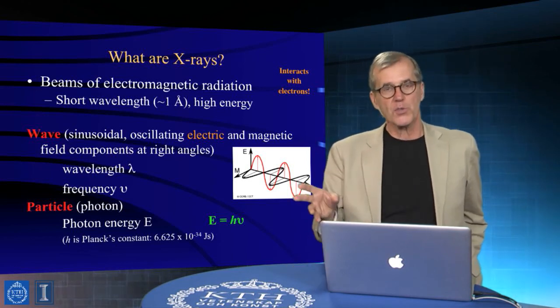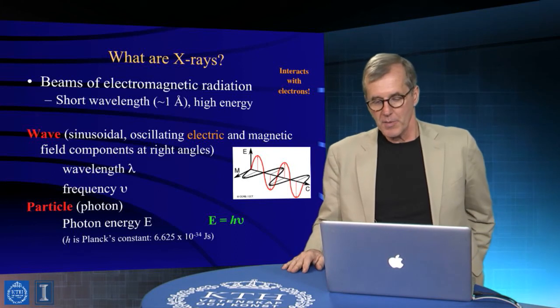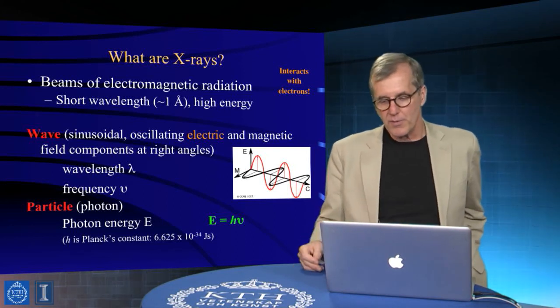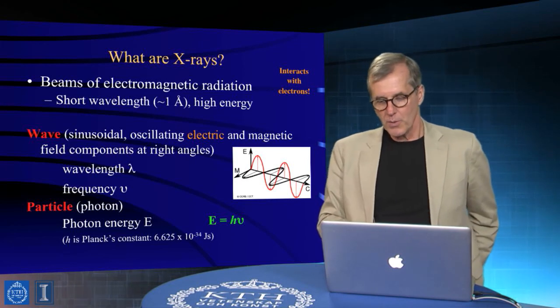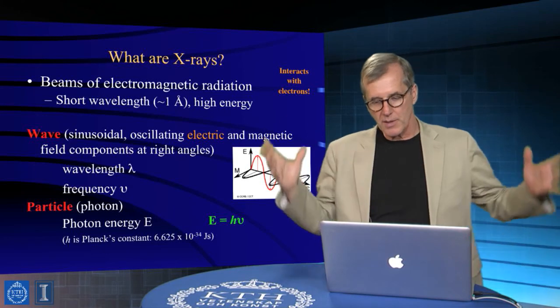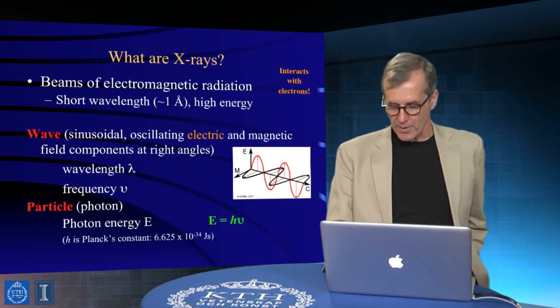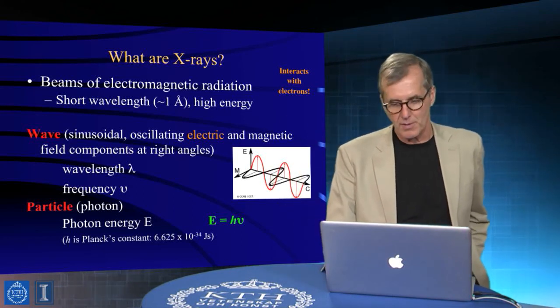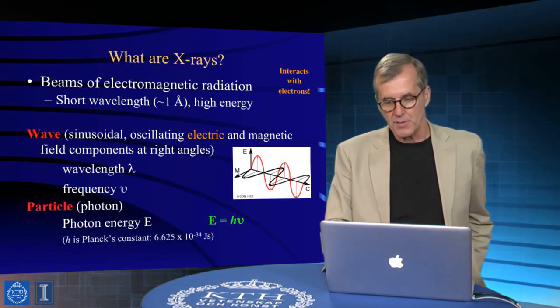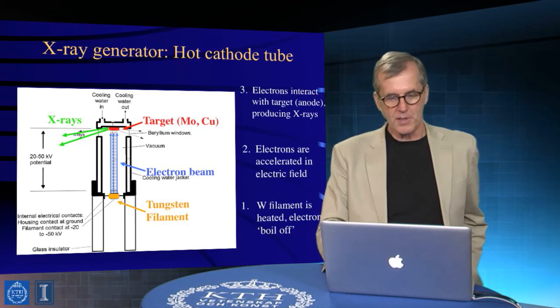So we get a crystal structure not because it figures out where the nuclei are, but rather it figures out where the areas of electron density surrounding the nuclei are, and hence the position of the atoms themselves. So that's a little subtlety.